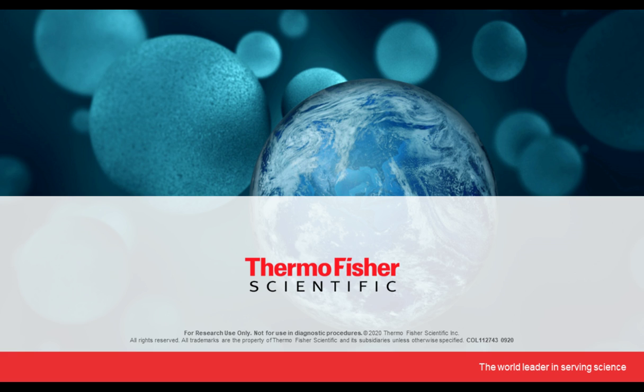Now, after no-stain protein labeling reagent, can I use fluorescent secondary antibodies, red and green, without any problems? Good question. As I said, no-stain is a fluorescent probe, which has an excitation at 488 and emission at 590. So obviously you would not be able to use a fluorescent secondary antibody that also has an emission at 590. But there is a range of fluorescent secondary antibodies in the IR and far-IR ranges, with emission at 700, 750, 800, and so on.